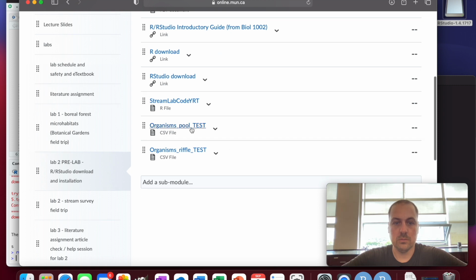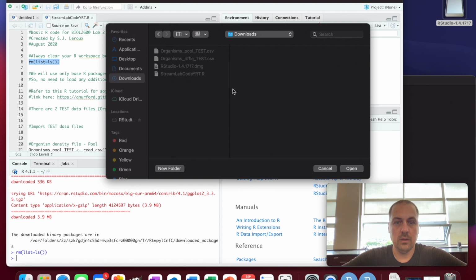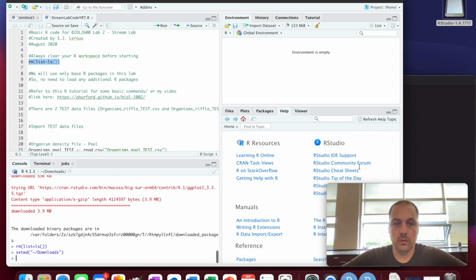Organisms pool test, organisms riffle test. If you select Downloads here and go open, it shows you that you set your working directory to Downloads, and now that's going to solve about 84% of your problems.